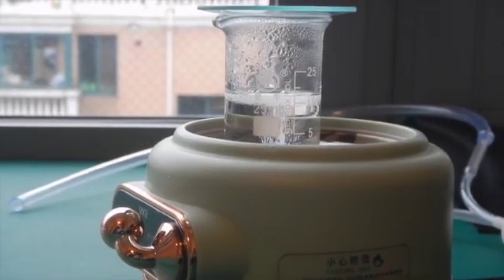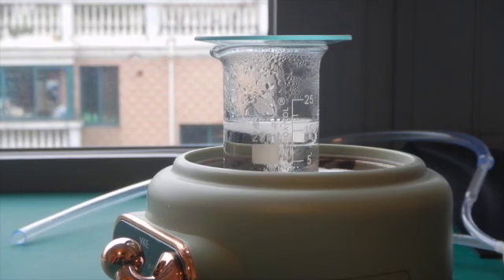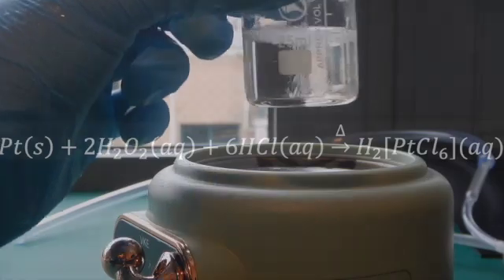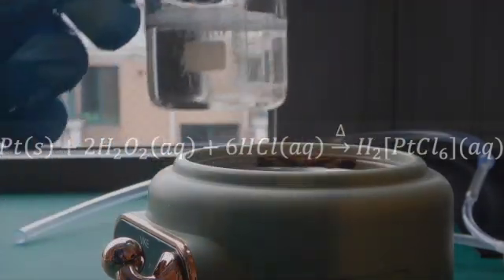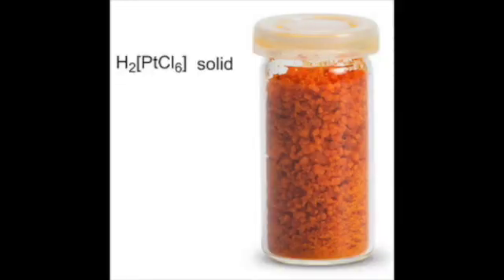Here it is 20 minutes later. It might not be obvious on camera, but the color is changing to a slight yellow. This is because the platinum reacts with hydrogen peroxide and hydrochloric acid to form hexachloroplatinic acid, which is bright yellow in aqueous solution.